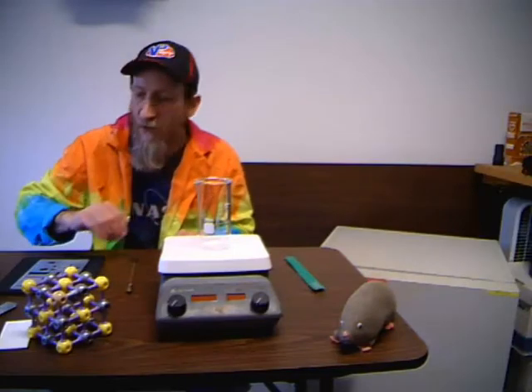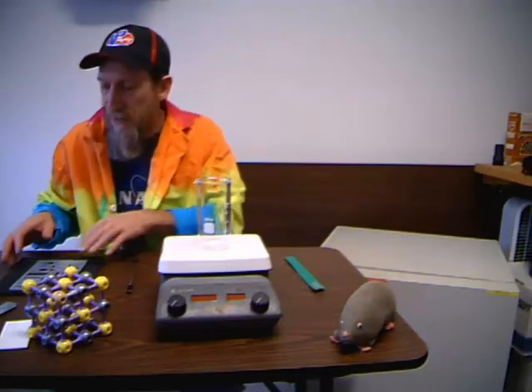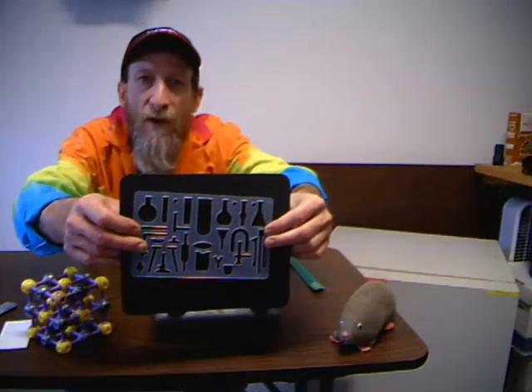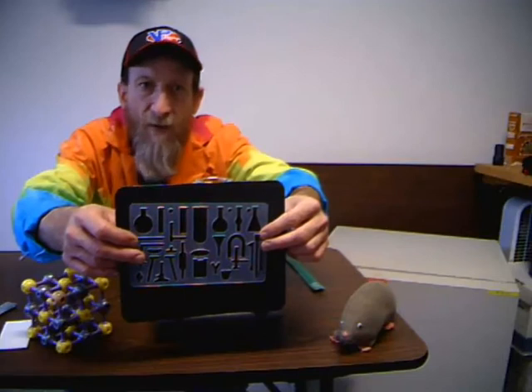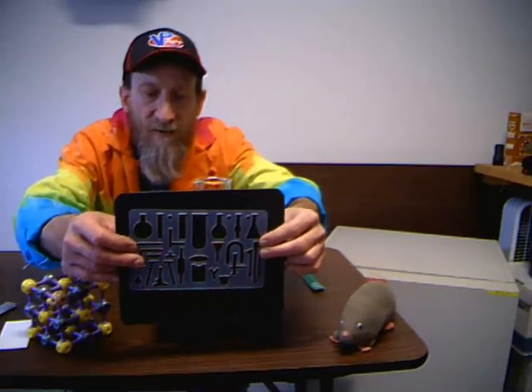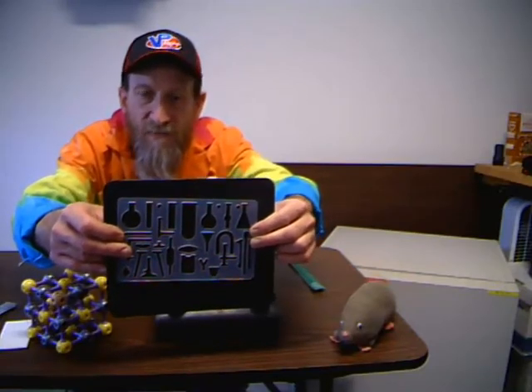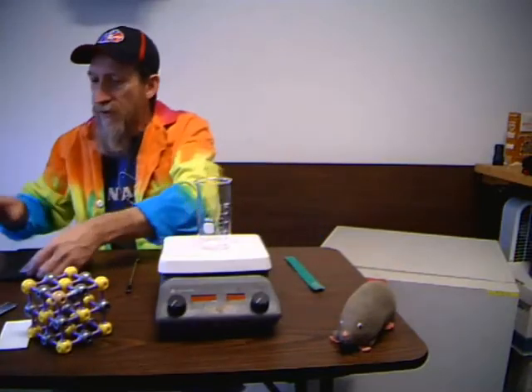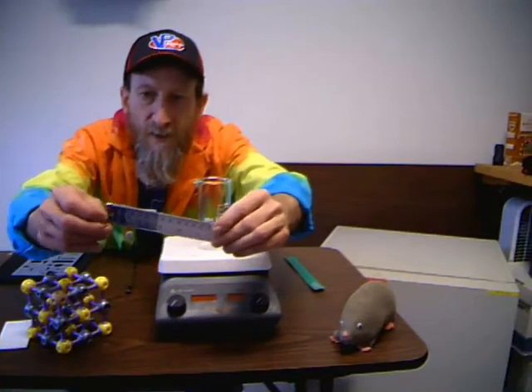Now we're going to concentrate on the hot plate with the magnetic stirrer. But I did want to mention a couple of useful things that are very helpful in the lab, especially when you have a laboratory notebook. The first is a chemical stencil. When you have to draw diagrams of all these different apparatuses in lab reports, this makes it a lot easier than trying to freehand draw it and a lot quicker. In addition to a stencil, you're going to want a ruler as well.